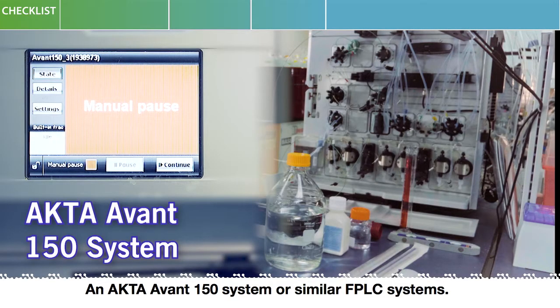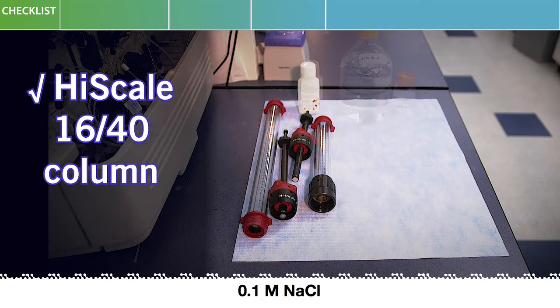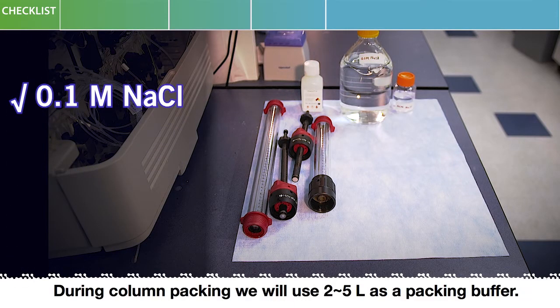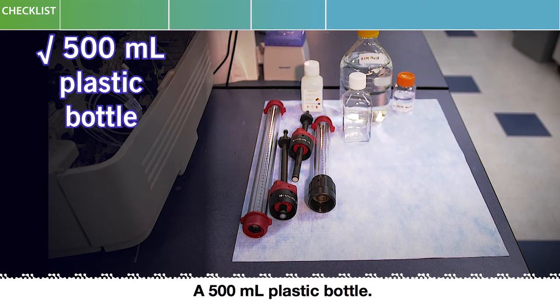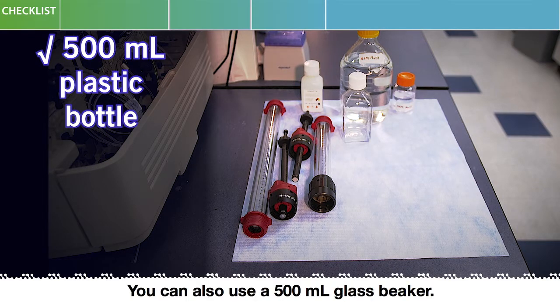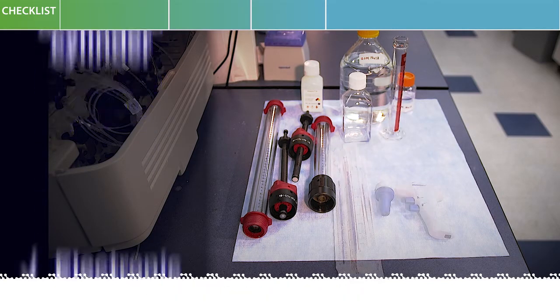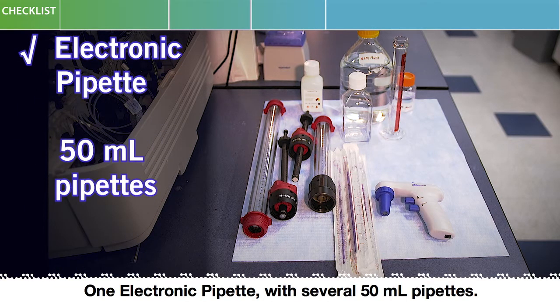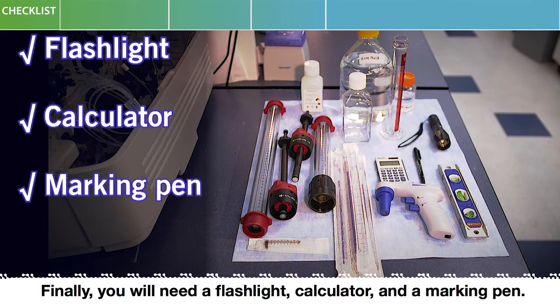An ACTA-Avant 150 system or similar FPLC systems. A HiScale 1640 or similar column. 0.1 molar sodium chloride — during column packing we will use 2 to 5 liters as a packing buffer. A 500 milliliter plastic bottle or glass beaker. A 100 milliliter graduated cylinder. One electronic pipette with several 50 milliliter pipettes. A level, a plastic syringe, a flashlight, calculator, and a marking pen.